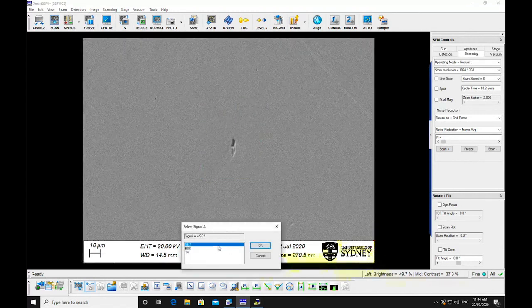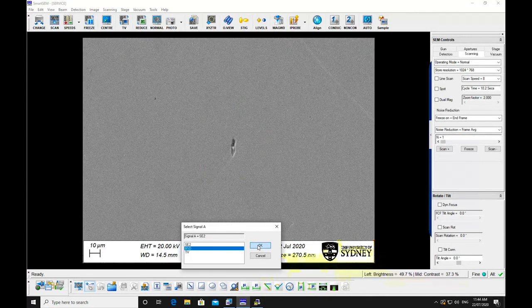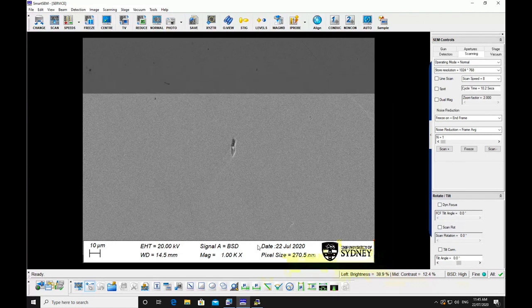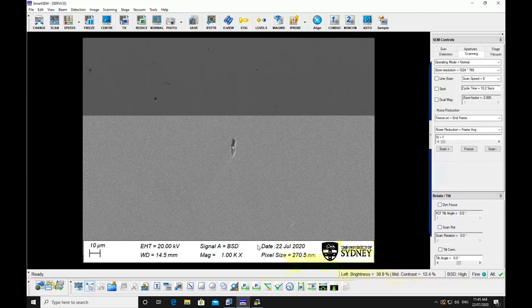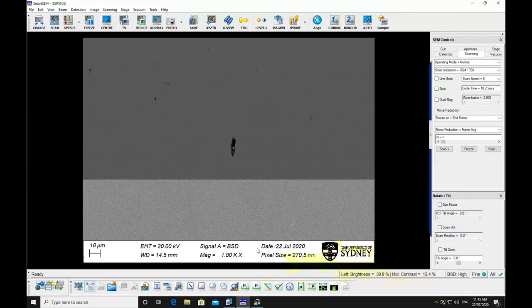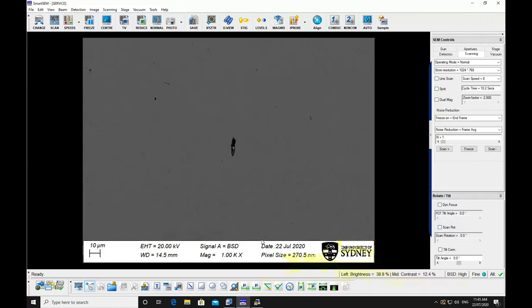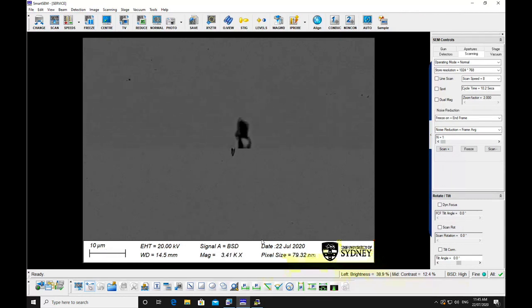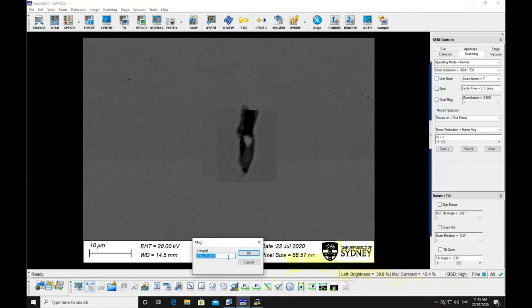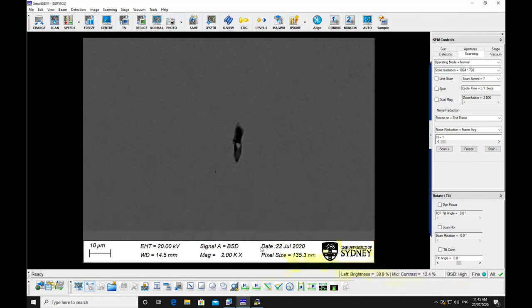Select the detector you require, either SE2 for topographic or BSD for compositional imaging. Focus and stigmate the image at two to four times the magnification you want to capture the image. Adjust the brightness and contrast so that the maximum detail can be seen in the image.